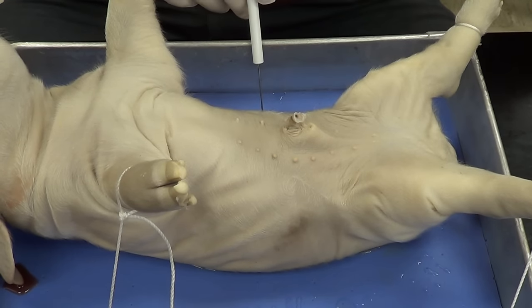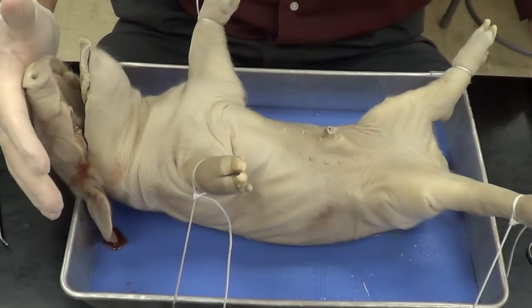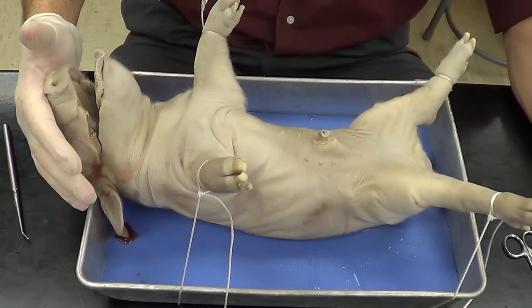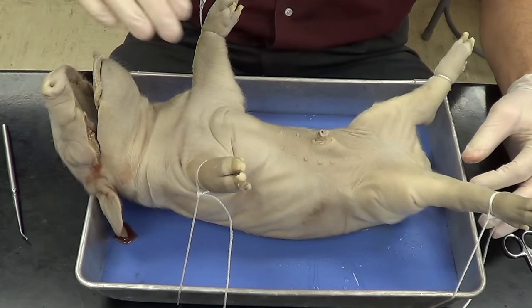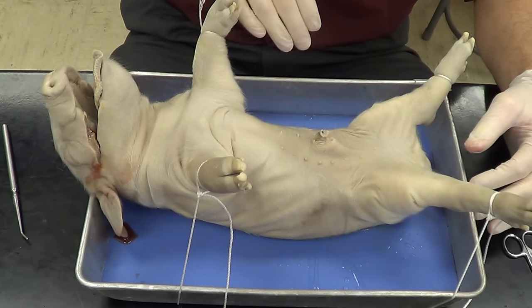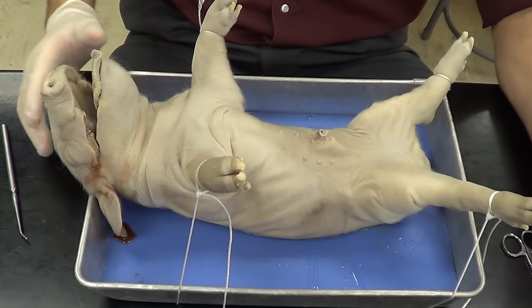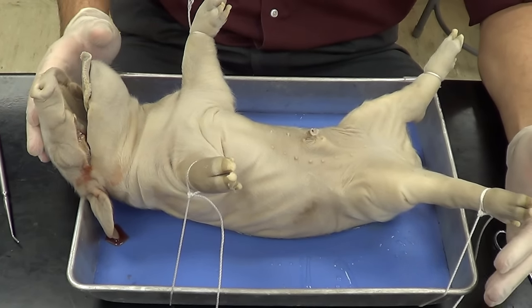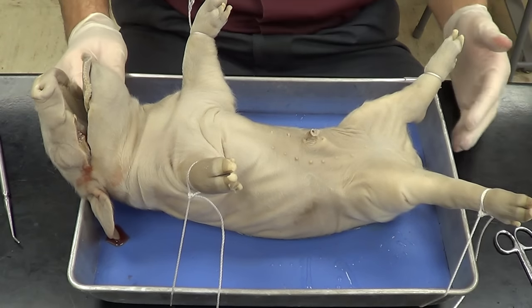Before I do that, let's go ahead and orient ourselves. The headward aspect of the pig is going to be anterior. The tail aspect is going to be posterior. The belly side is going to be ventral, and the back side is going to be dorsal. Keep that in mind, because I will be using terms that relate to those particular sides or aspects of the pig.